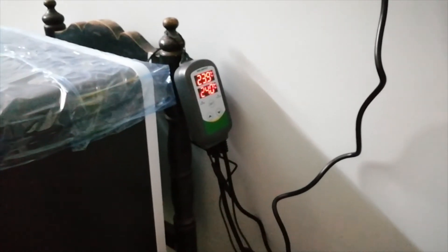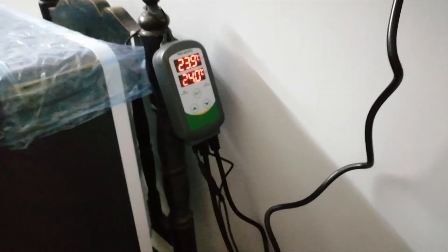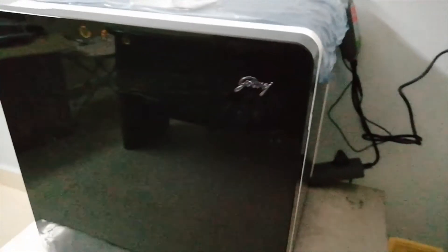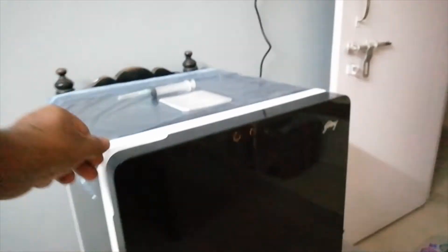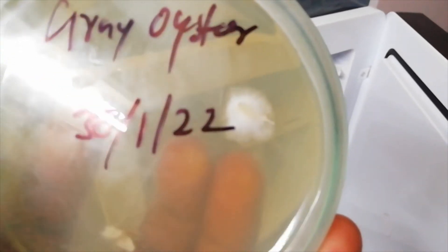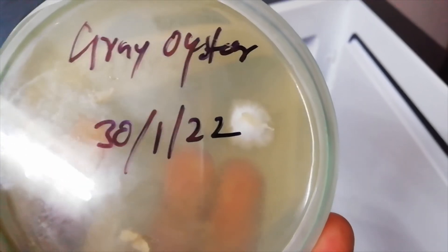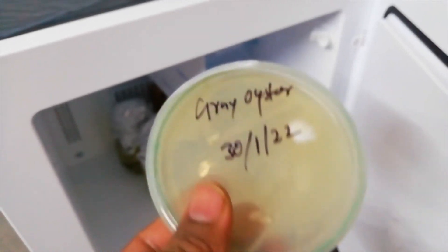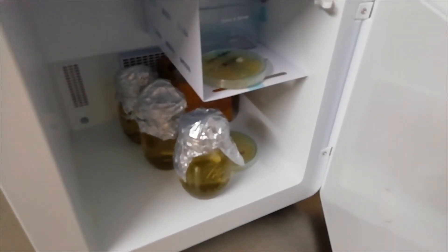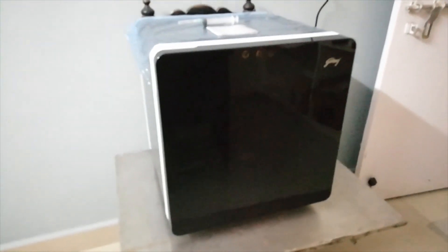So far this is working fine for me, because my goal is to control the temperature and keep the petri dishes in good condition. Since I inoculated on the 30th, I have been maintaining 24 degrees Celsius — my mycelium growth has been good and I see no contaminations. I clean this fridge every 10 to 15 days with alcohol and keep everything clean. You can try this too — all you need is one fridge and the temperature controller.